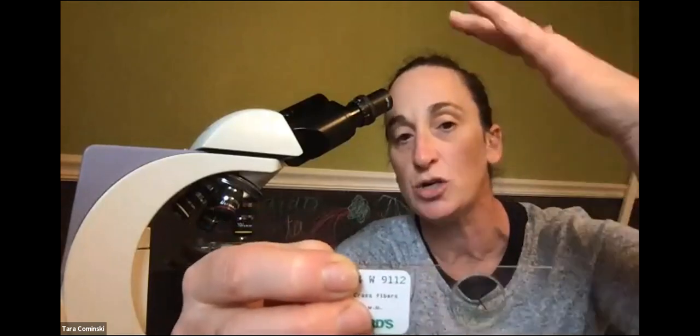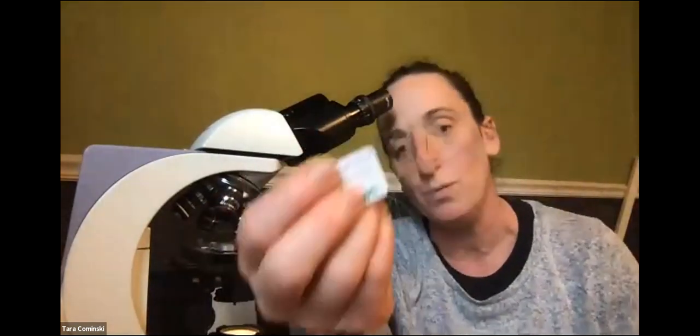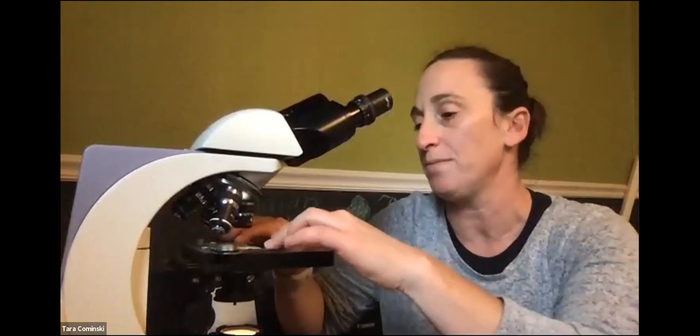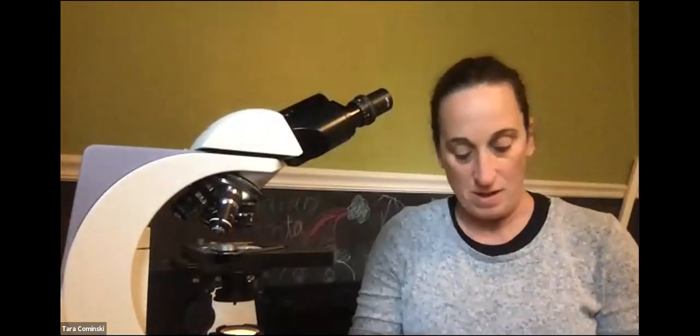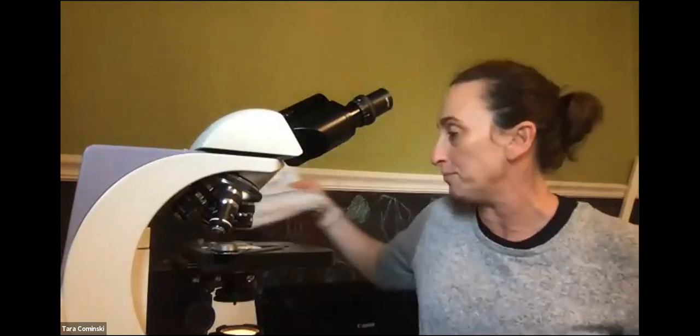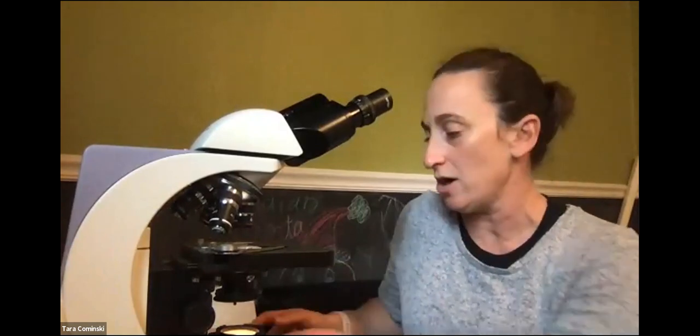Essentially, as you're using the focus knob, that's moving through the object that you're looking at. I'll show you that, and I'll do that screen share one more time, and then we'll determine together what was top, what was middle, and what was bottom, all right? So let me go back to that share again.